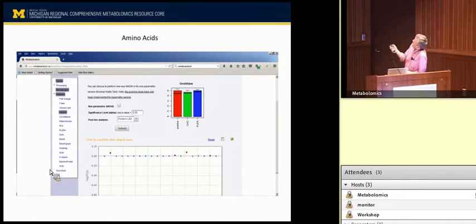So this is another screenshot of MetaboAnalyst. It actually will do an ANOVA for you. If you have 3 different groups, it'll do the calculations for you, and it'll show you which ones are bouncing up to be a little bit statistically significant. And you can see that some of these values are just a little bit over. And so this spot is ornithine.